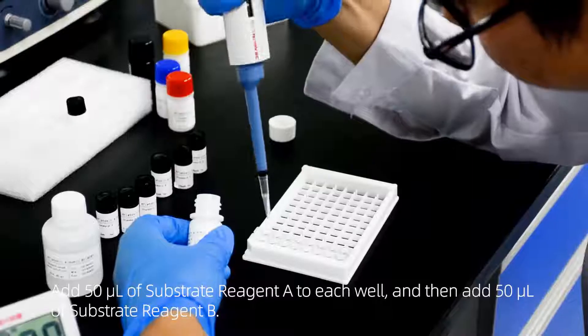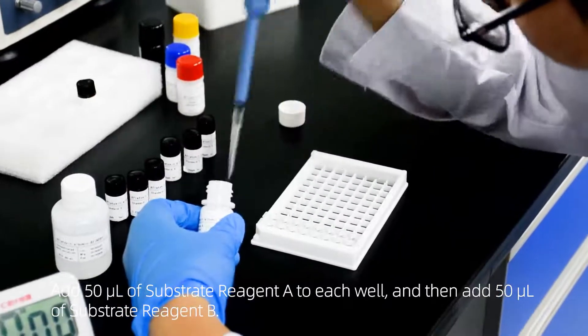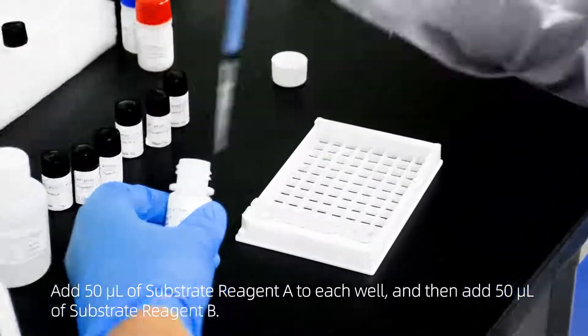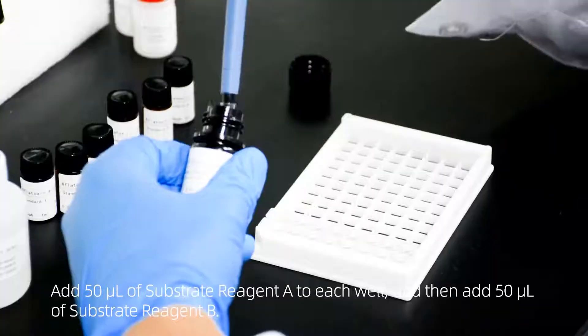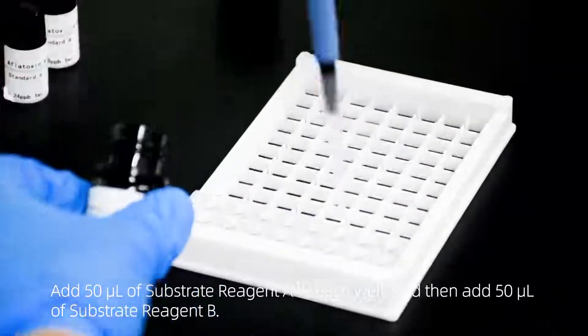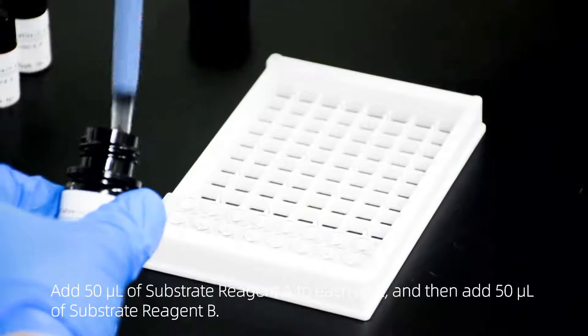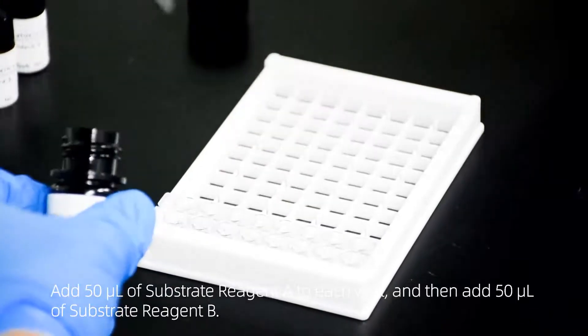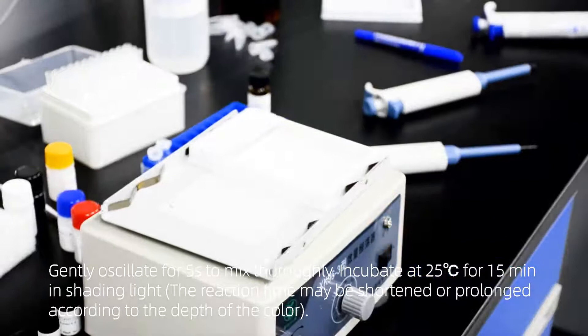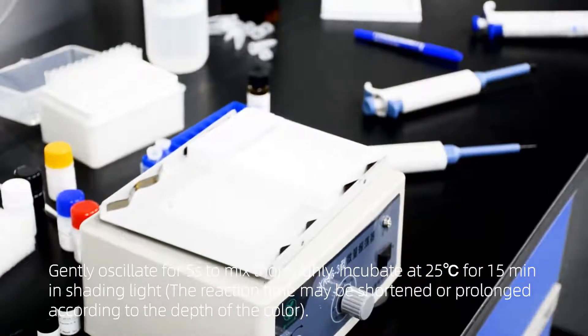Add 50 microliters of substrate reagent A to each well, then add 50 microliters of substrate reagent B. Gently oscillate for 5 seconds to mix thoroughly.